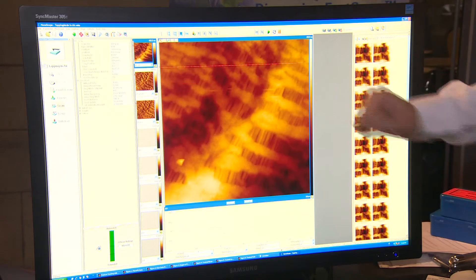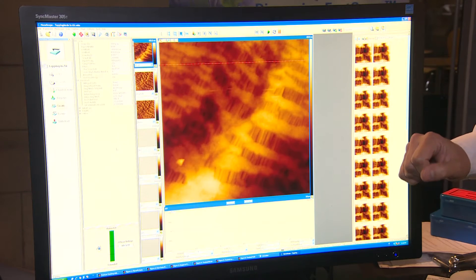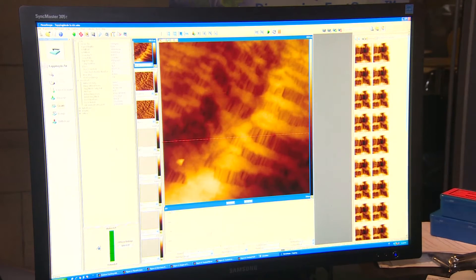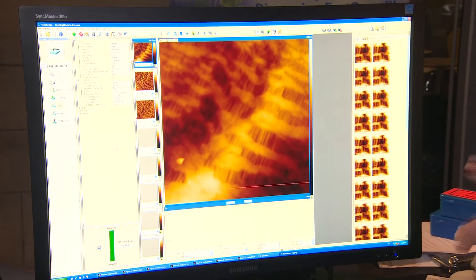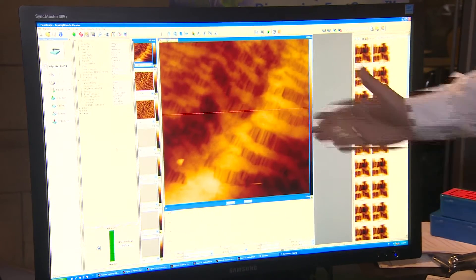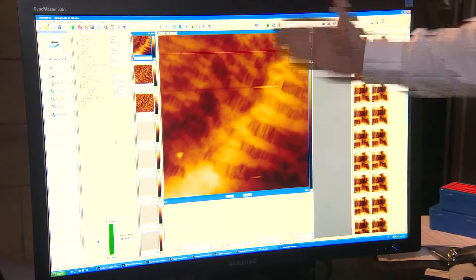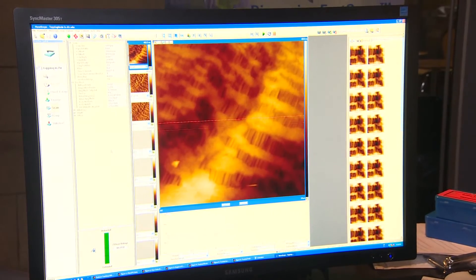Here is an example of the software running over a sample called a CELGA membrane. This membrane is found on your car battery. What we are doing here is imaging this rough sample quickly for AFM.